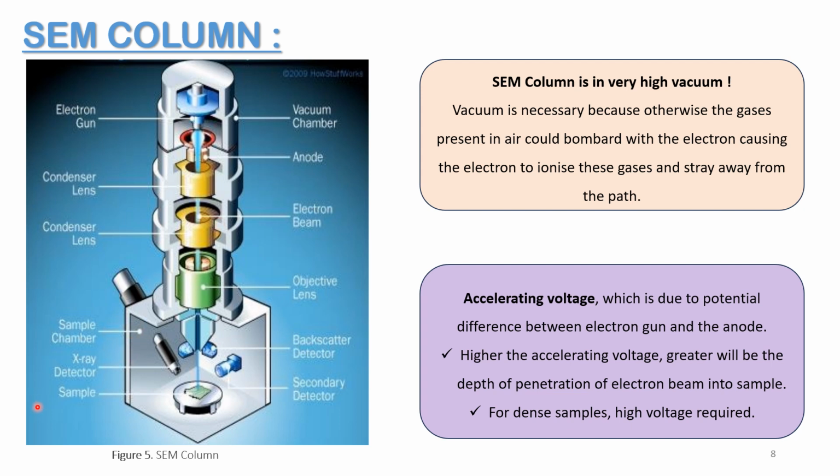And the sample chamber is not kept in high vacuum because some of the samples may not withstand the high vacuum. So to maintain that, the SEM column is kept in high vacuum. However, the sample chamber is not kept in the vacuum.